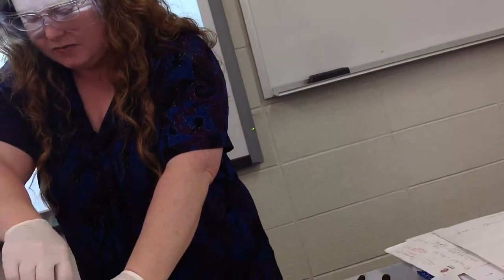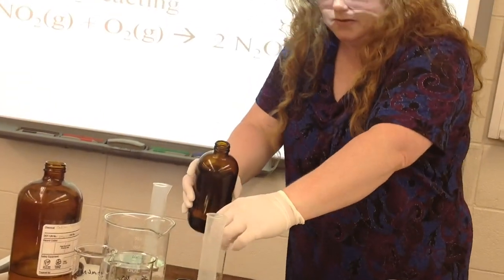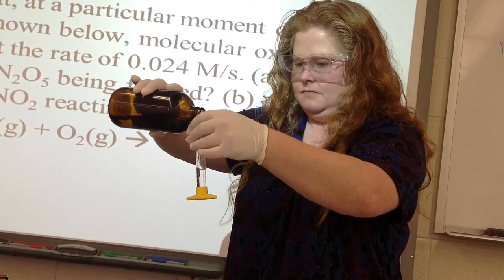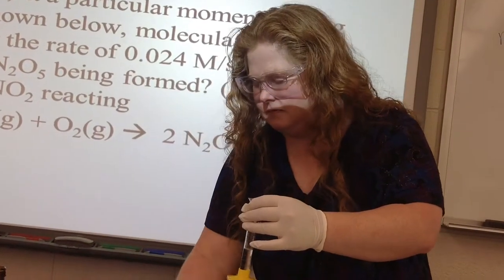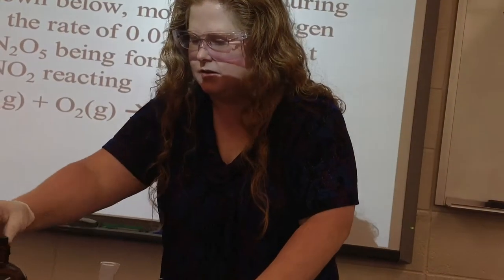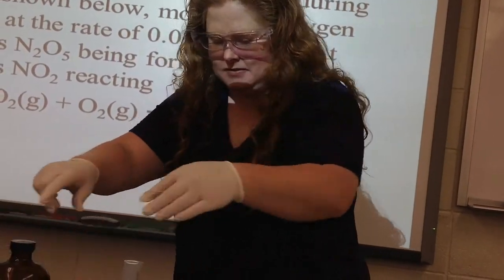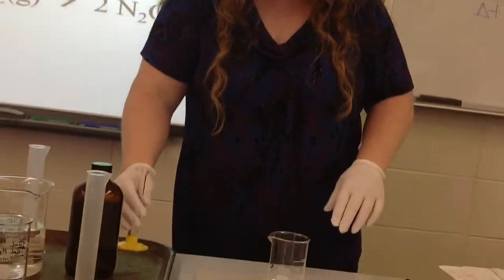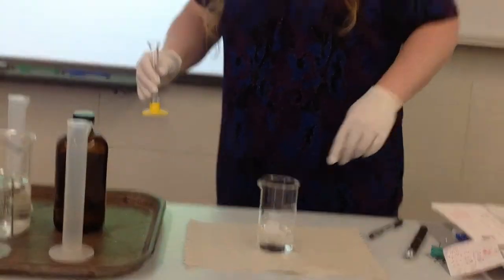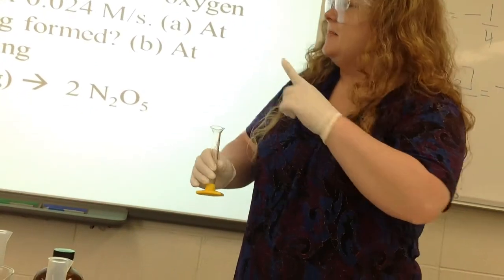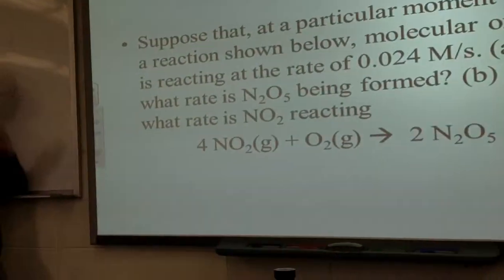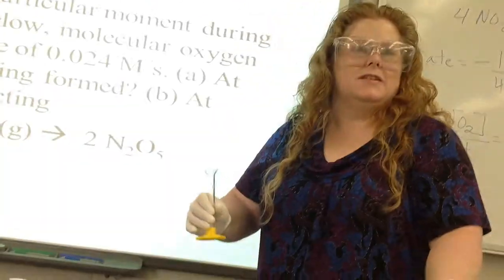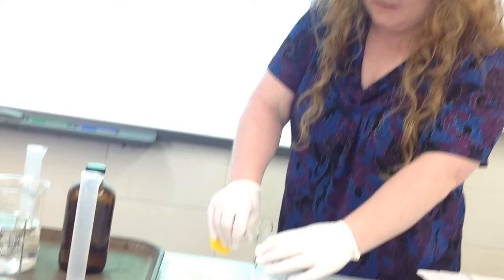So I'm going to add some HCl to this. So I'm just going to add about 5 milliliters of this. And these reagents kind of stink, so I'm going to put the bottles away. And so the reaction itself will probably have a smell. One of the products is sulfur dioxide, I believe, as I recall. All right, so I'm going to, as soon as I pour this in here, go ahead and just start the timer. I might say stop, stop it. And that will be at the point where I can't see the X anymore. All right, so you ready? Go.